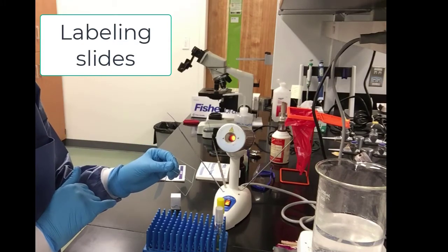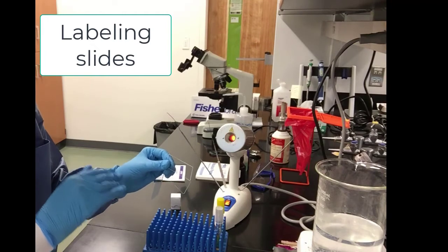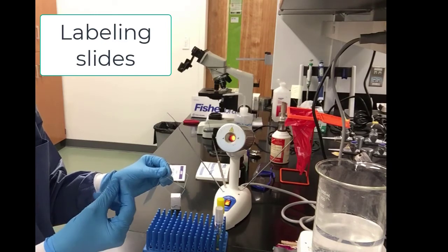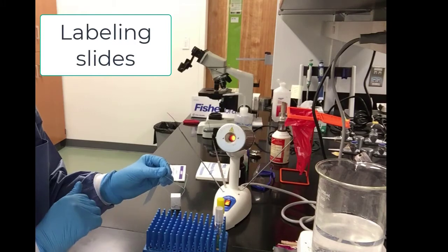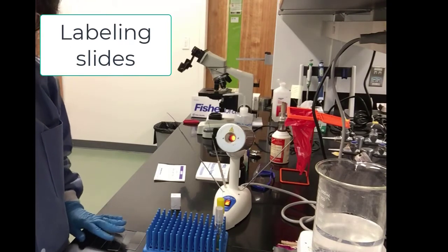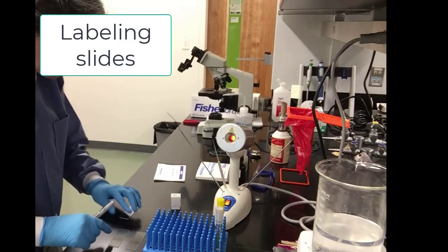There are the 3 slides. We will be labeling the slides first. One will be a staph, the other one will be a mycobacterium, and the other will be a mix of both staph and mycobacterium. So we want to make sure we label these properly, and we want to make sure our slides are clean. Any dirt or any kind of oil will interfere with the staining procedure.